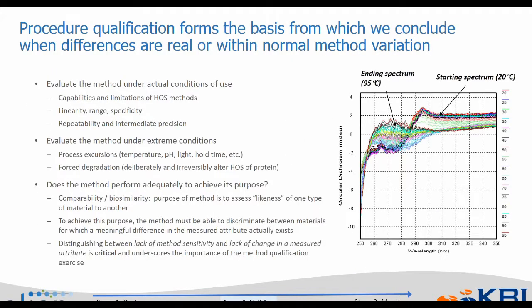Okay. I have a few comments related to stage 2 validation, and then one quick slide at the end related to monitoring. So now that we've designed the method to a certain set of requirements that we need, including achieving the signal to noise that we need, and using a quantitative response that we think matches the type of analysis that we will be performing, at this stage, we move on to the validation of the method. And there are a couple important points to think about during method validation.